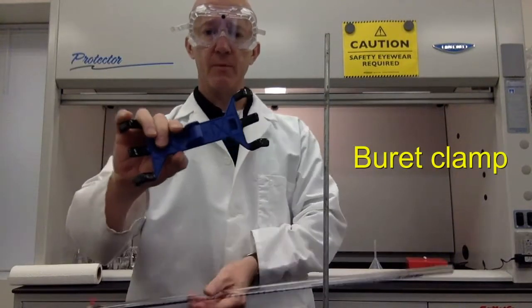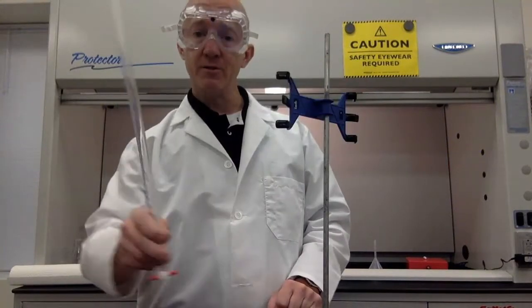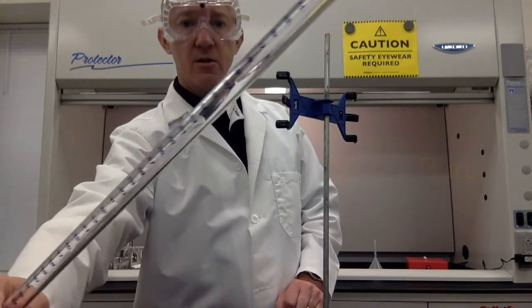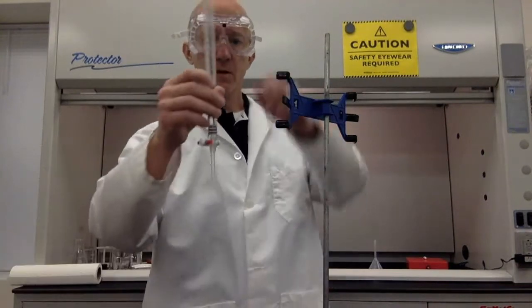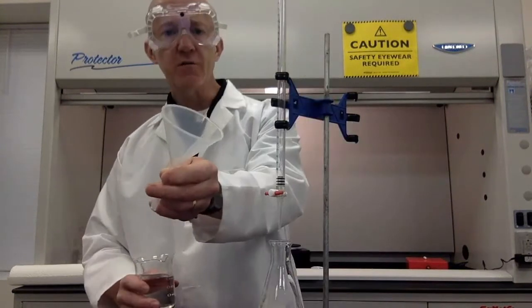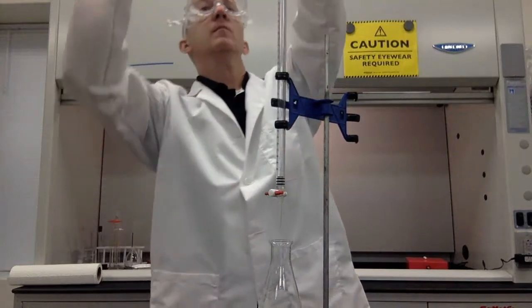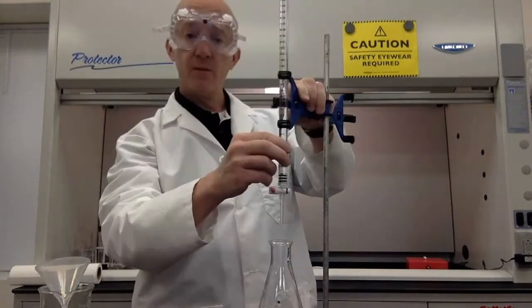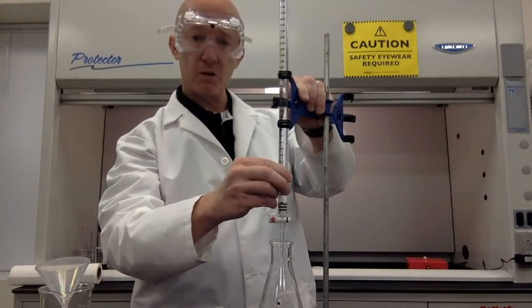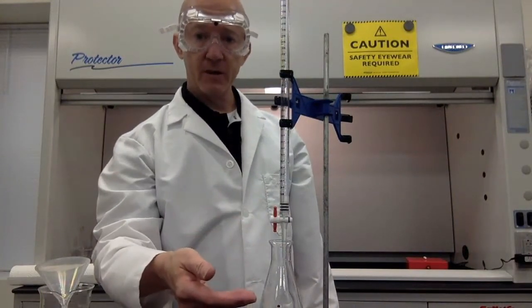This is called a burette clamp. It goes on the stand like so. A burette clamp holds a burette. It's a long tube as you can see that has graduations on it. Just like the graduated cylinder. At one end we have a valve. Using a funnel we can put a liquid into the burette. The burette clamp allows for better positioning of our burette. Once we get it where we like then we can open the valve and allow for the transfer of liquid into a flask.